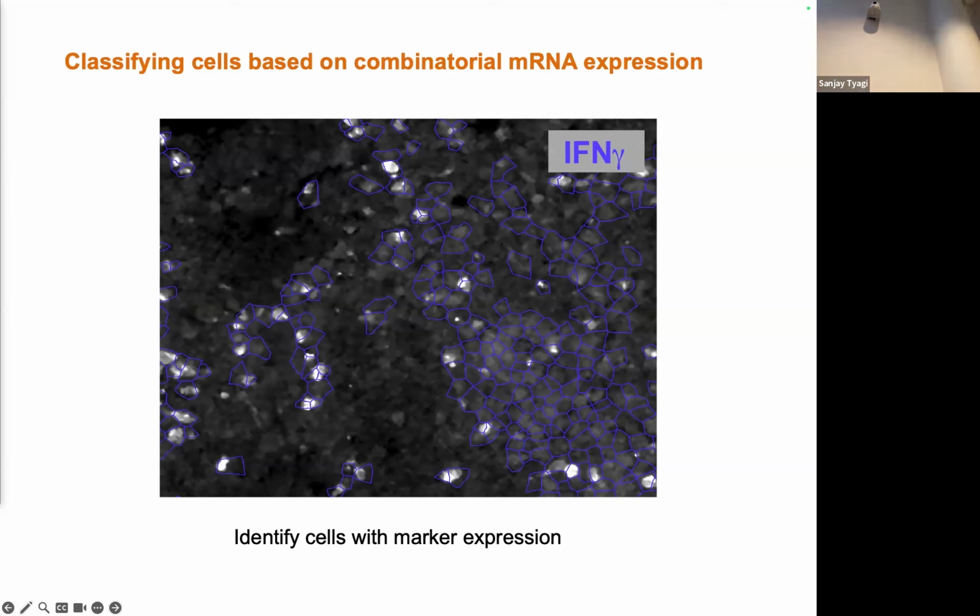For example, all cells are defined by nuclei. So this cell is capturing that area, but this cell is also getting a little bit of that signal. And here it's more apparent. So it's not perfect, and this segmentation procedure to identify cells in complex tissue like this remains a challenge even today.